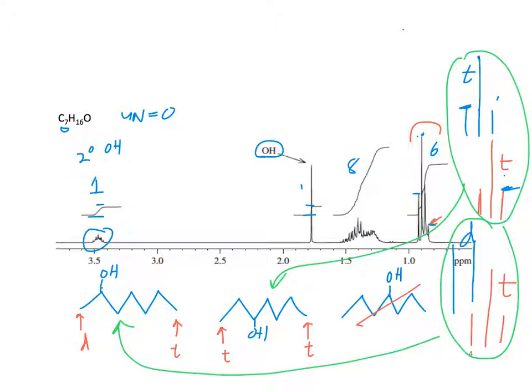All right, so it's a little bit hard to tell, right? I think we at least narrowed it down to those two. But it's not super easy to tell between those two. I think this end one is actually the correct one from what I got the NMR from, since I had the cheat sheet.